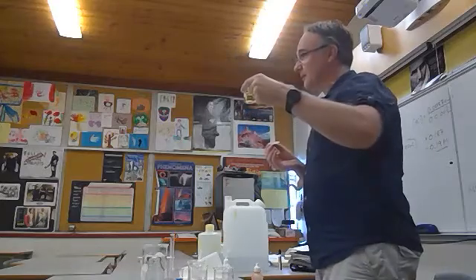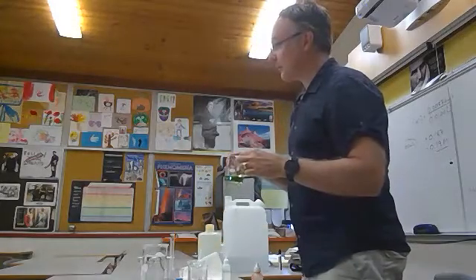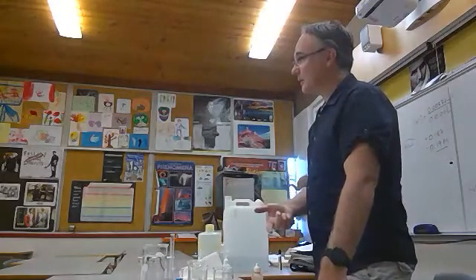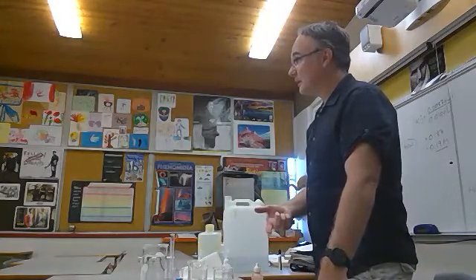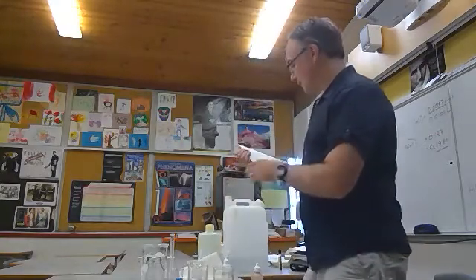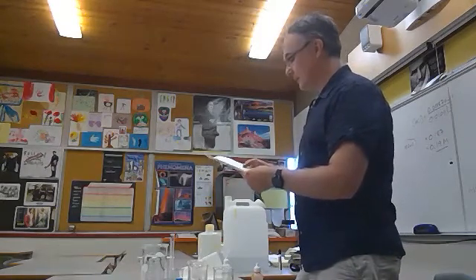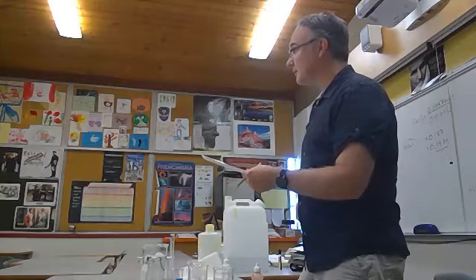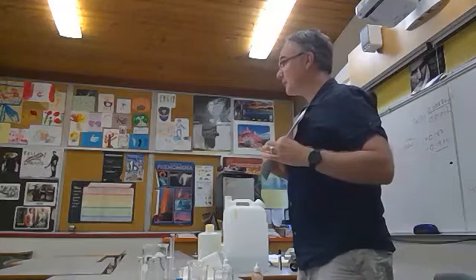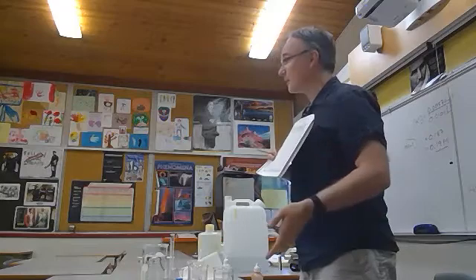And we can see the color now is a yellowy color. And that's different than the original green color, right? So basically the CO2 that I breathe into that has mixed with the water to produce carbonic acid. If you look on your data table under the acids, under carbonic acid, which is also CO2 plus water, it's just below halfway down the table. If you look right over here, I think it shows you CO2 and water. So that's actually carbonic acid, which is what I just made there.